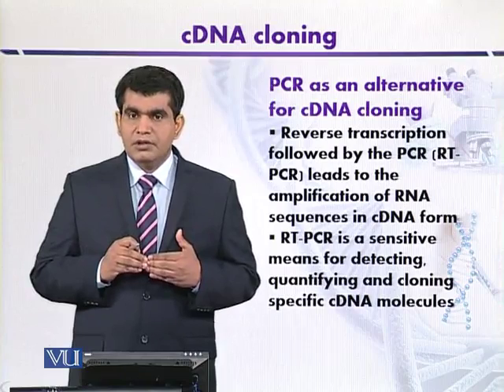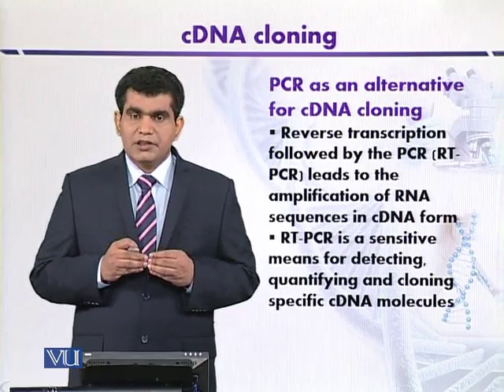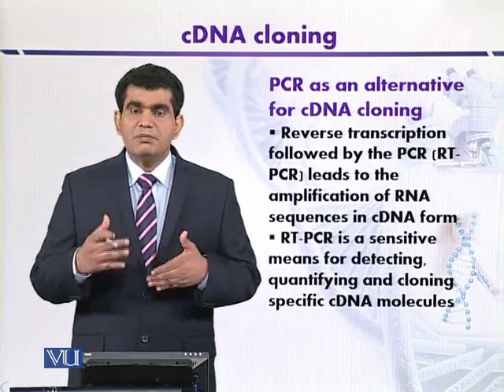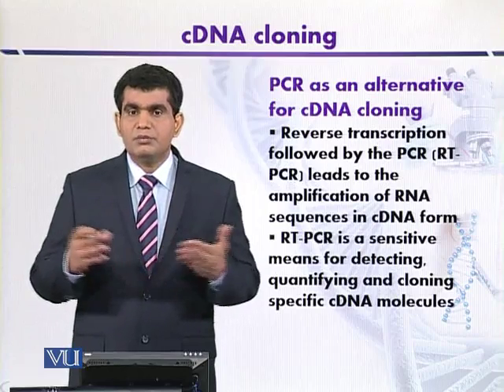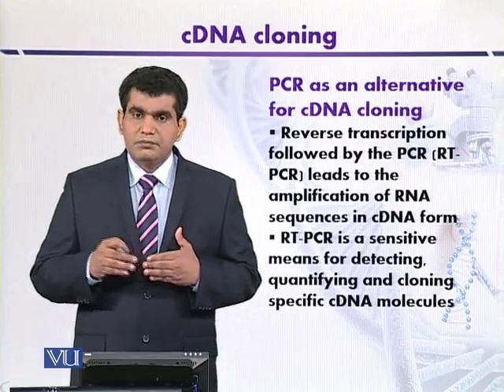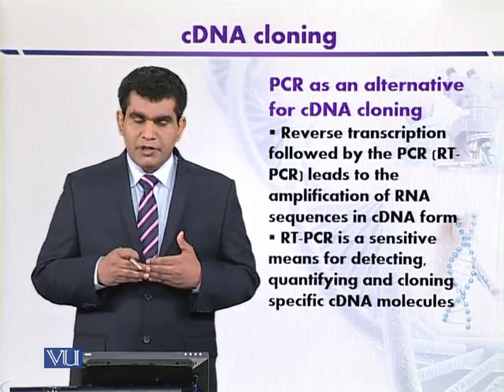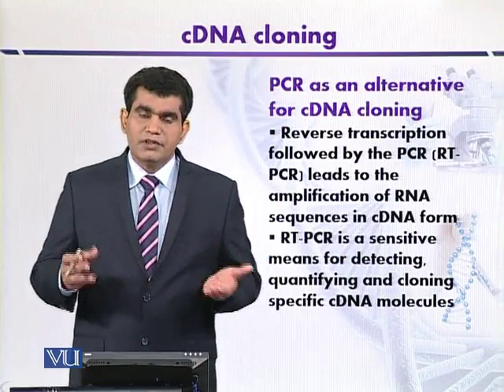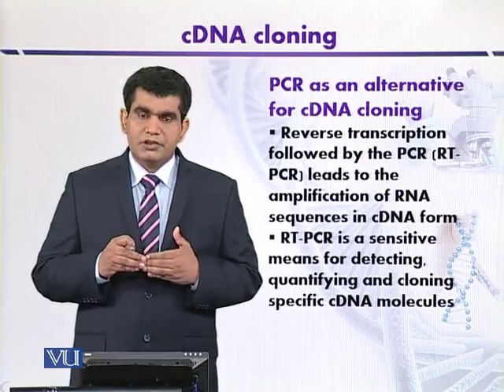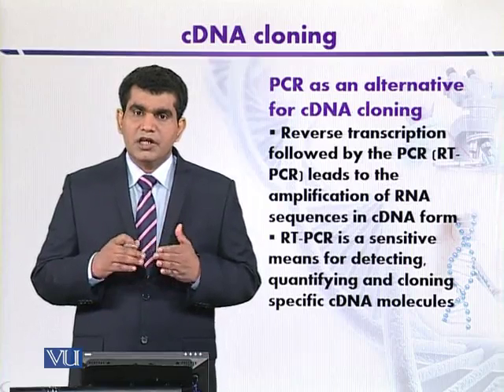When extracting messenger RNA from a specific tissue, genomic DNA may also be extracted, representing a contaminant. Under such a situation, genomic DNA may also be amplified along with cDNA, which is problematic. To address this, it is desirable to use primers that bind at different exons so they can amplify single RNA in different fragments.